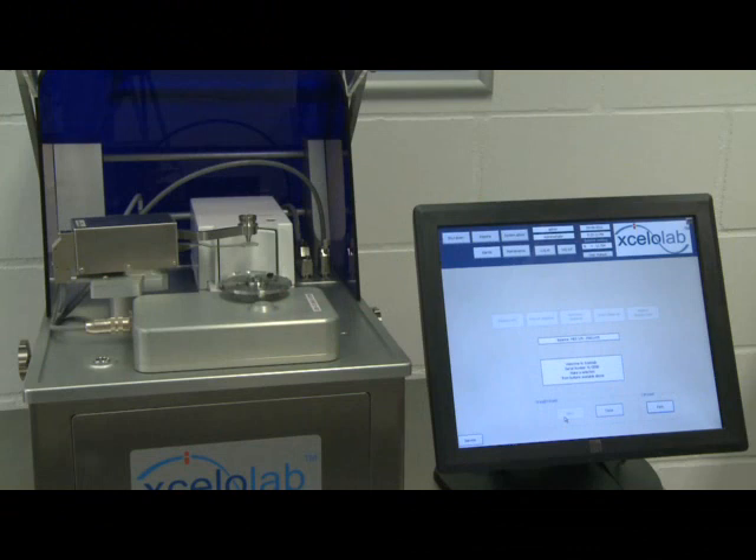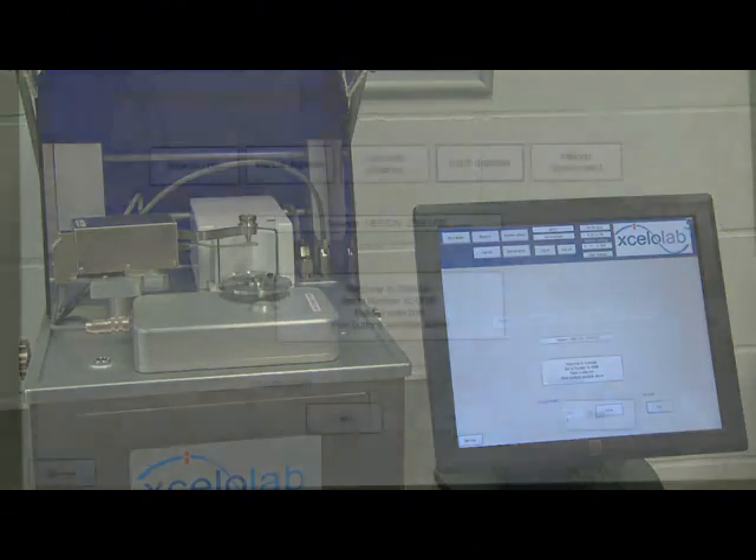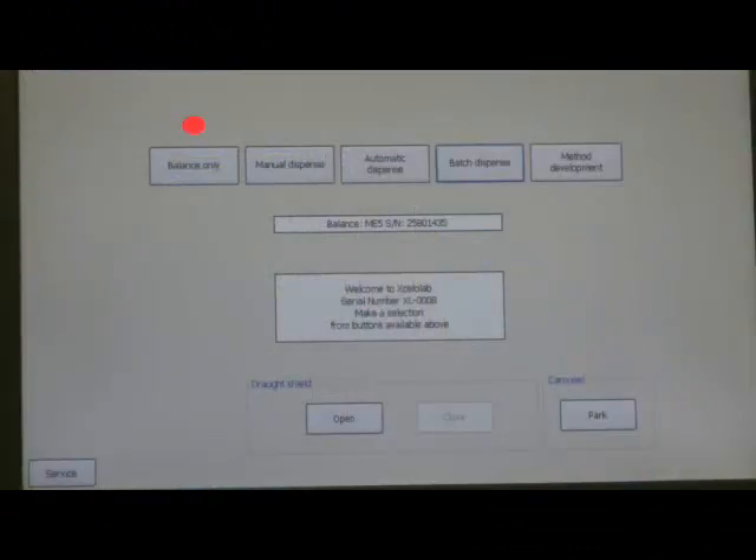The Xcelolab dispenser has five modes of operation: balance only, for use as a weighing scale; manual dispense, touch screen controlled incremental dispensing; automatic dispense, automatic dispense to target weight; batch dispense, repeatable automatic dispensing with consolidated report; and method development, for optimizing automatic dispense parameters.